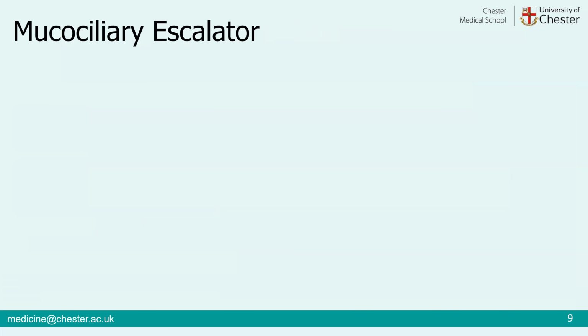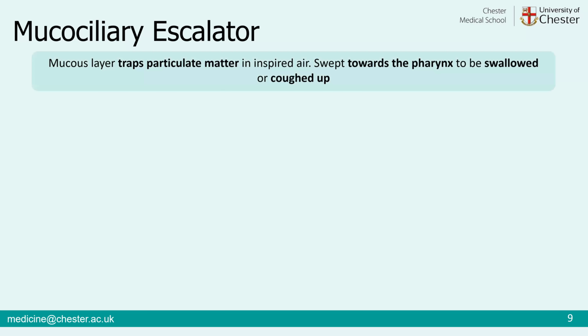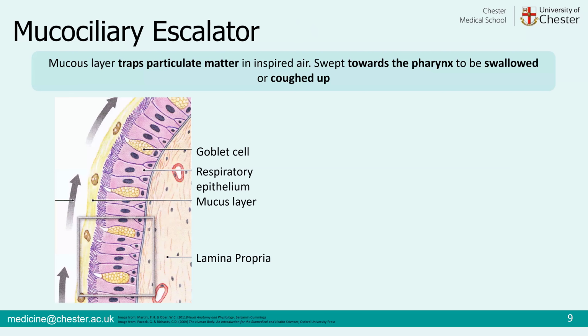So what is that? Well, that is part of our respiratory defense. So effectively what we have is this mucus layer sitting on top of that pseudostratified ciliated columnar epithelium with goblet cells, and it'll capture inhaled particulate matter and microbes. So for example, here you can see those little brown dots are just examples of inhaled particulate matter. So they get captured in that mucus, and then those cilia, so remember cilia are motile projections, they'll waft and they'll move that mucus, which has got that captured particulate matter or microorganisms, along.